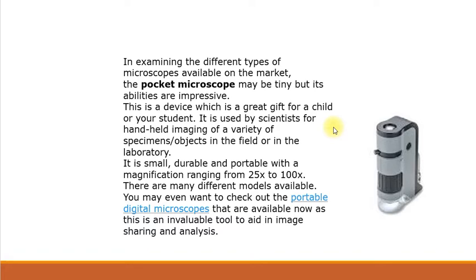You may even want to check out the portable digital microscopes that are available now, as this is an invaluable tool to aid in image sharing and analysis. Nowadays this is really a very great gift for scientists and students to carry for the process of research and work in the field.